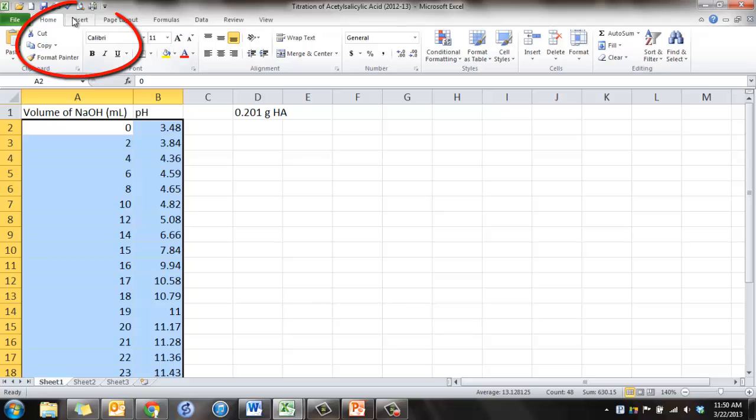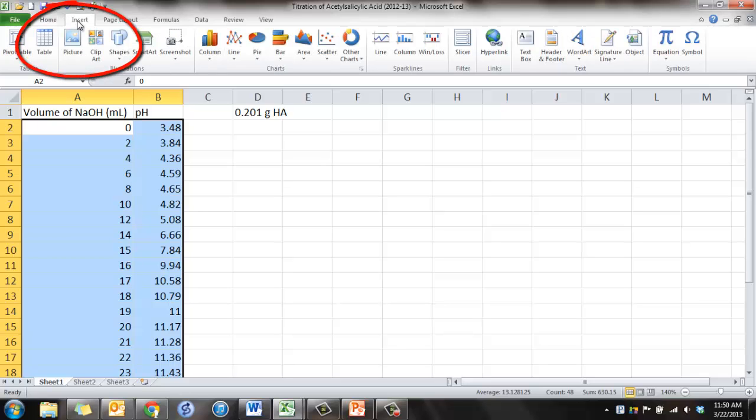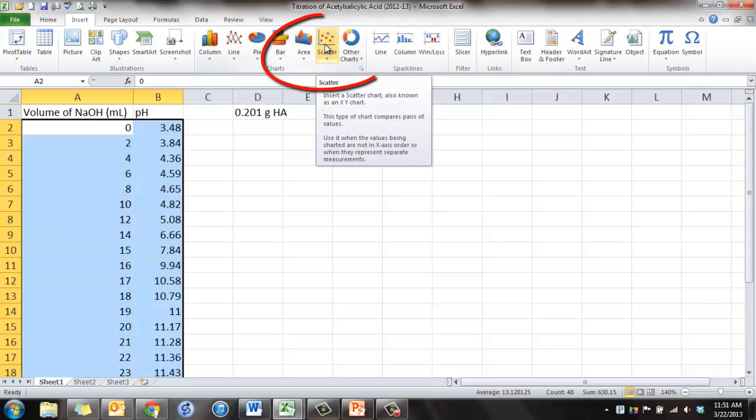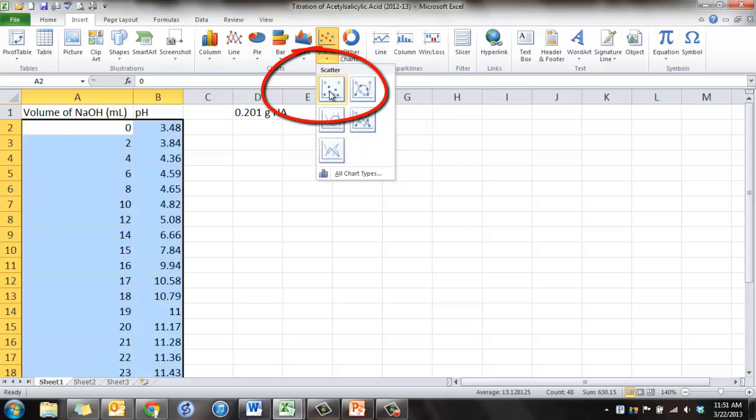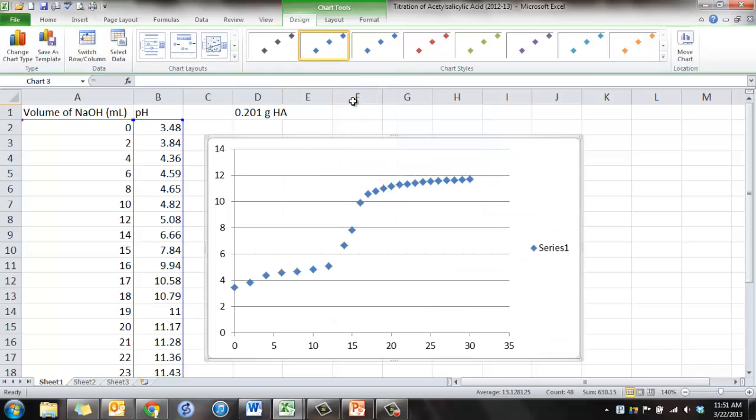And you're going to click on Insert. Then click on the scatter plot. And we're going to pick the one where it's just the dots, there's no lines connecting. So click on that, and it graphs the data for you.